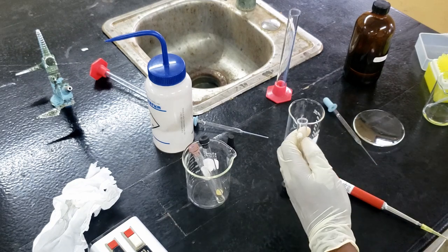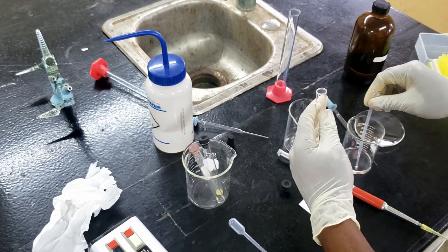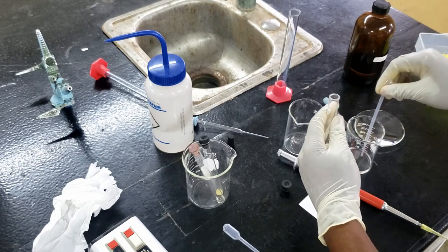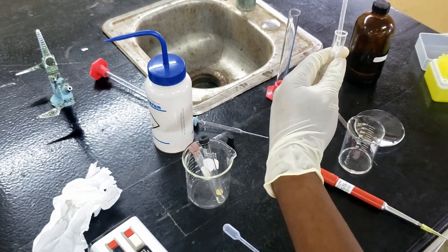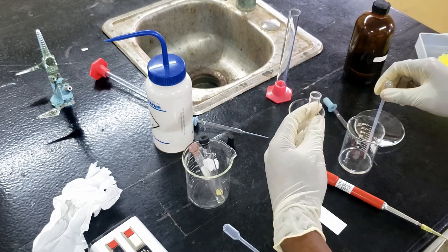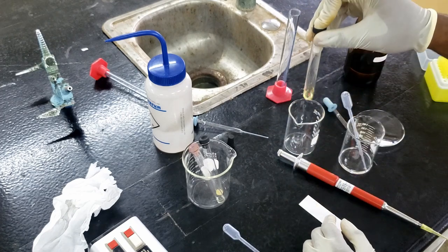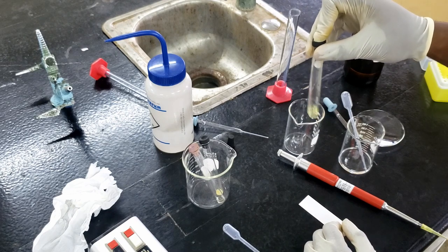And then to that, I'm going to add 0.5 mLs of ethyl acetate. And we mix.